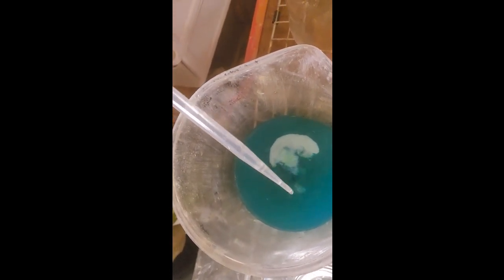Now, quickly, I'm just gonna show you the amount of silver that this has already dissolved. Just watch this, folks. All right, here we go. Ready? I'm going to add in a little bit of hydrochloric acid. Just one drop. Boom. You see that? That right there is your silver. That's silver chloride forming with the addition of hydrochloric acid.